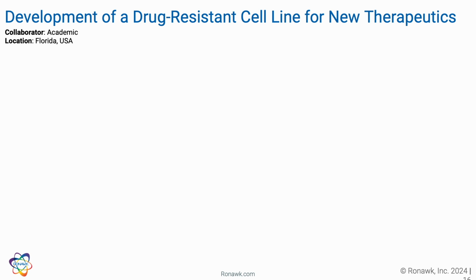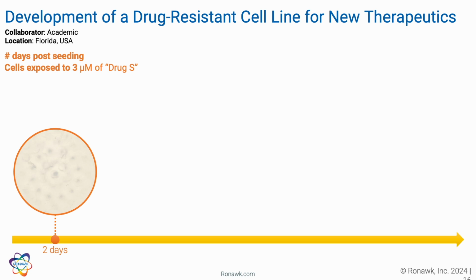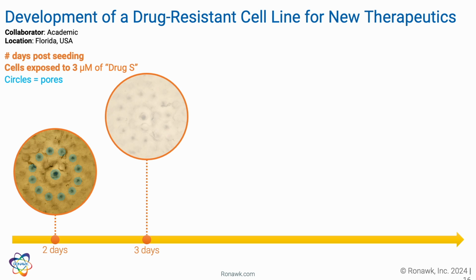For this area, this collaborator was interested in developing a drug-resistant cell line for the development of new therapeutics in their research. And this set of data is going to be divided into two. We're going to show you some images here, and then we're going to dive into the development of that persistent cell line. But just as a note, for the days of culture here, the cells have been exposed to the drug from the beginning, from being seeded into the blocks.